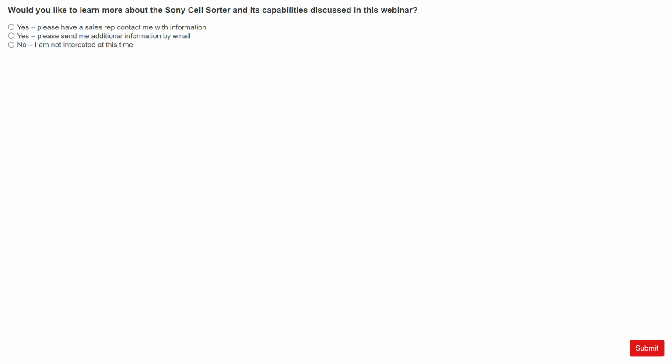We'd probably like to have a more specific discussion about how far along the project is and how much data you have on the existing platform, because for a lot of people, we're encouraging them to stay on the original technology they've used unless there's a really compelling reason to switch to GEM-X immediately, and then ultimately just start GEM-X, the new version, with any new projects you have going forward. So that would be a great thing to reach out to me about if you have any questions, or someone at 10x; we can provide more technical assistance about your specific project.